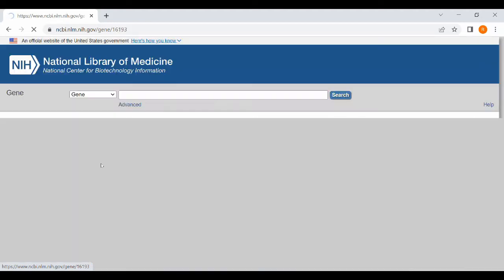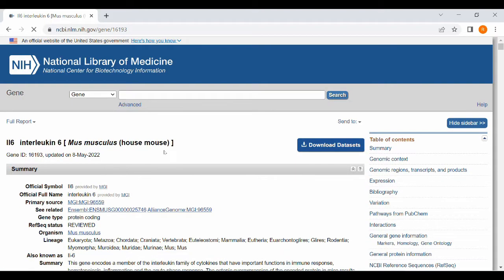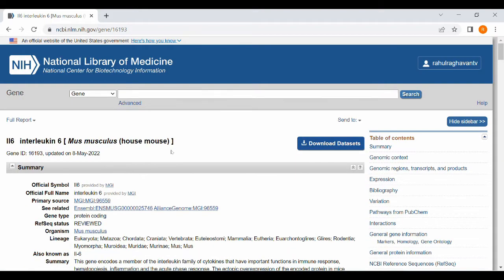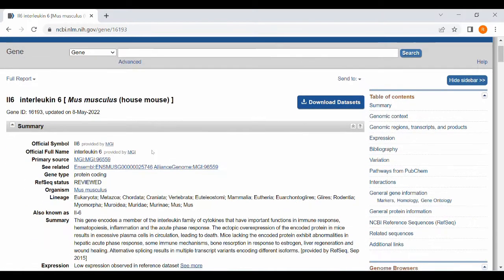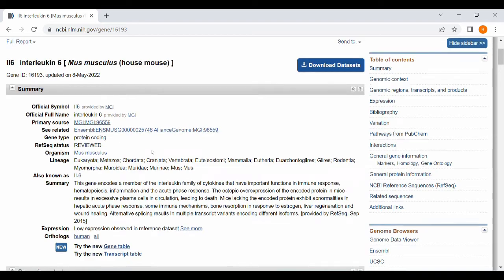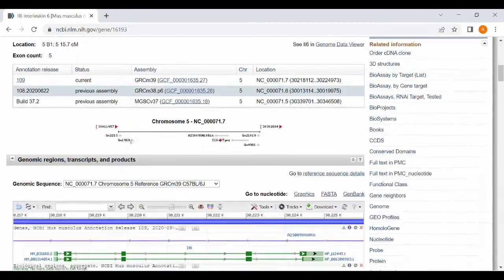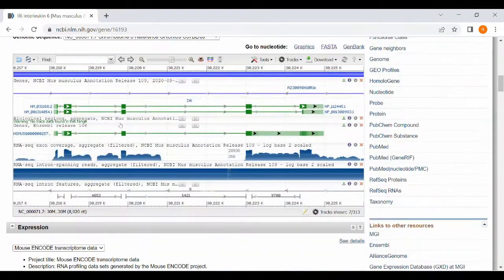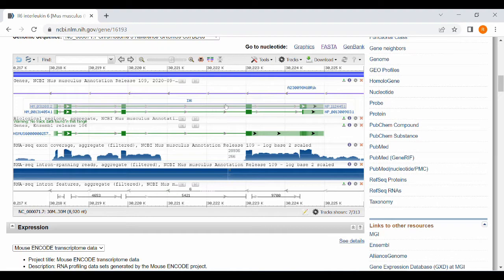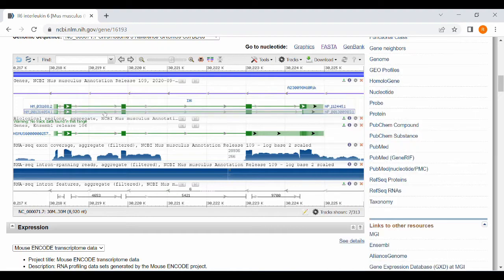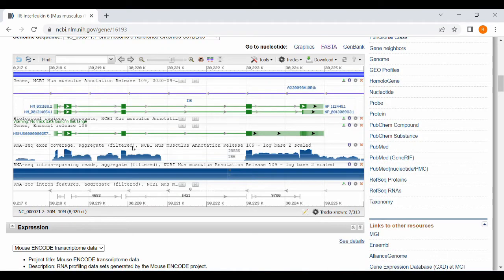So I click on the interleukin-6 mouse sequence. It will give all the details of the interleukin-6 mouse and it will also show the position of the interleukin-6 gene inside the mouse chromosome.